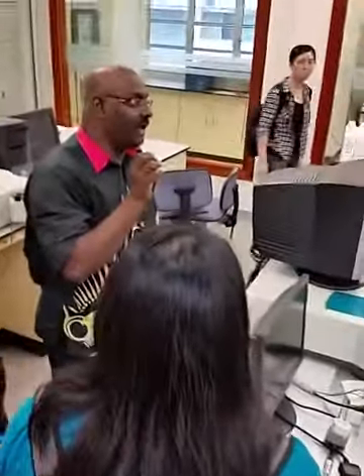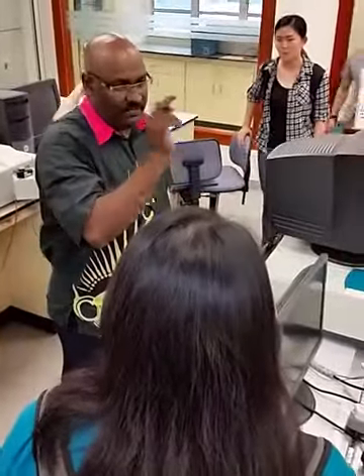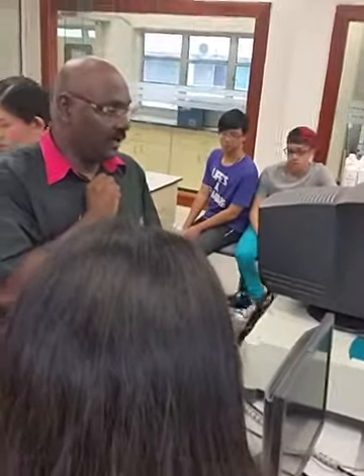AAS, atomic absorption spectrometer. This one we normally use for analysis to find heavy trace elements and heavy metals. But with this spectrometer you can only analyze one element at one time. You cannot do multi-element analysis. The concept is based on wavelength and atomization. We use heat energy to atomize, then the sensor will catch the signal using the wavelength. So that one is the atomic absorption spectrometer.